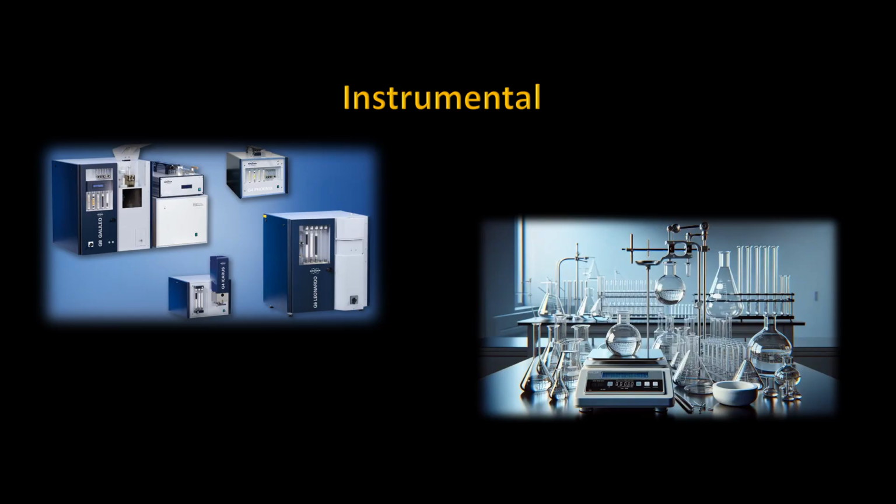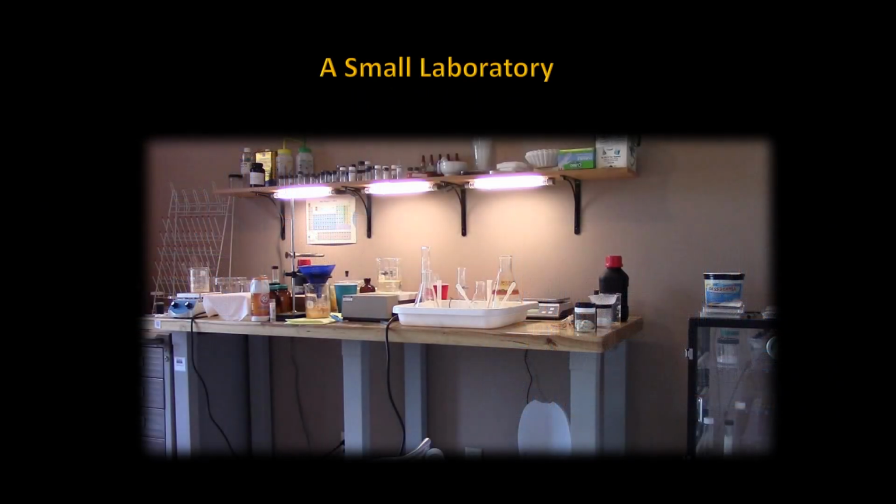Instrumentation is designed to analyze samples of low concentrations, in the parts per million and parts per billion range. Instrumental is not suited for samples that contain higher concentrations of analyte. Wet chemical analysis is best suited. Wet analysis for qualification can be fast and inexpensive.